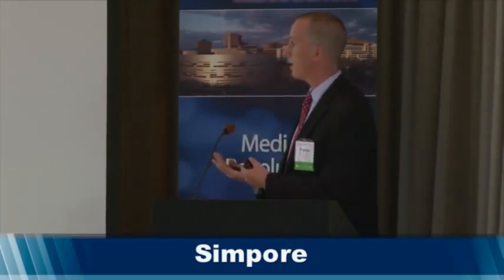Likewise, coming down to in vitro assays, the types of cells that are grown in these preclinical studies are oftentimes barrier cell types. Many of the studies that are required by the FDA look at how cells mimic the intestine. So does a drug molecule get through a layer of cells? That drug needs to not only get through the cells, but the membrane that supports those cells.